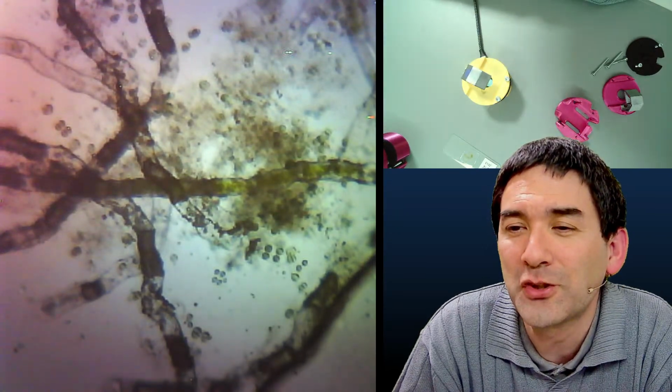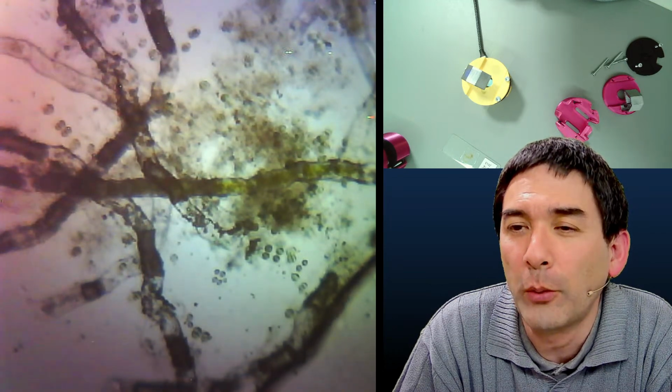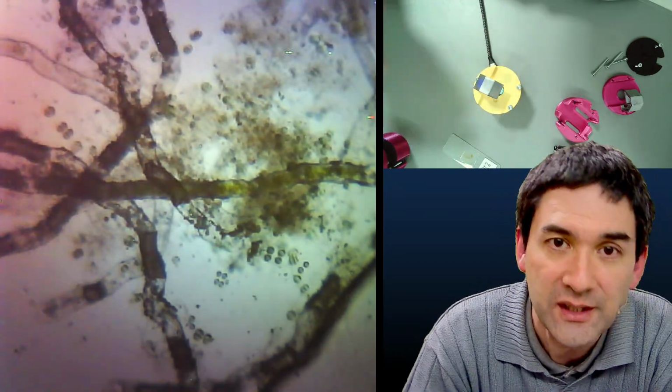Yeah, the demonstrator effect again. Yes. The field microscope option is indeed something, and what I've heard is that some people in education and so on are already using this system.